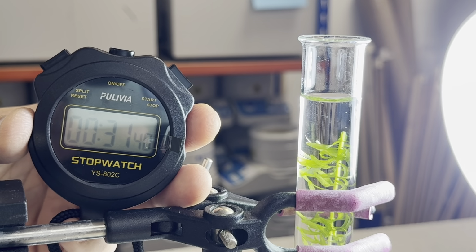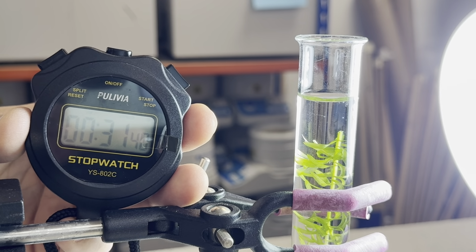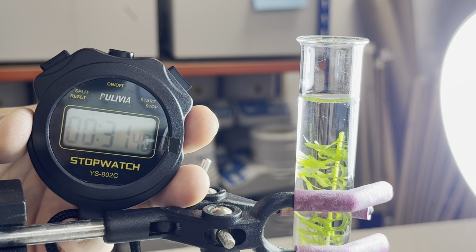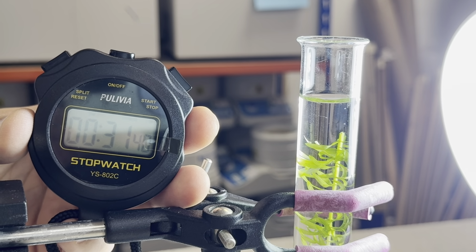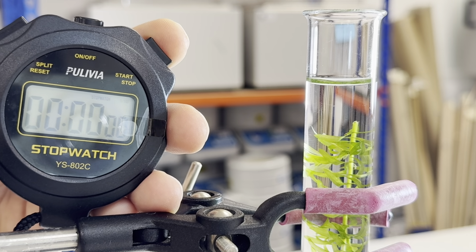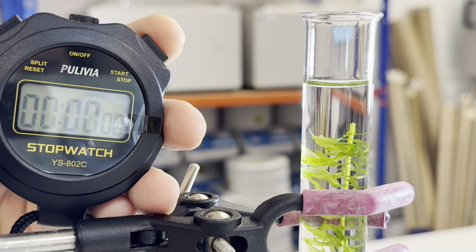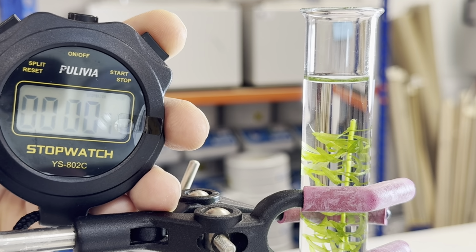So now we will increase to 50 centimeters apart between the light and the plant, and we'll see again. So now we are 50 centimeters apart, and we're gonna repeat again. So 30 seconds, number of bubbles, and now.